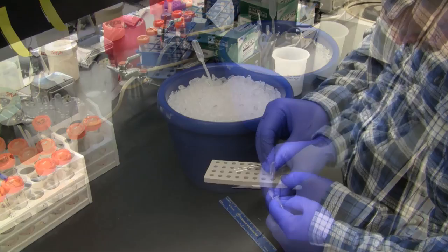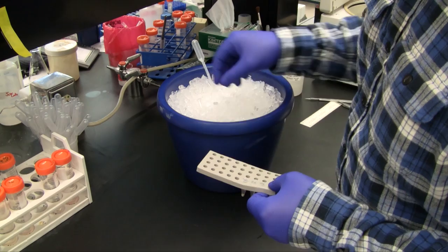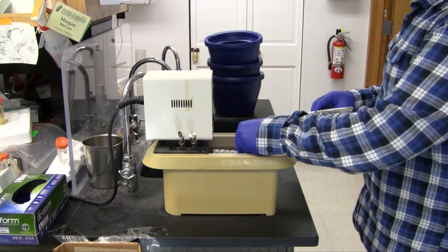After all samples have been collected, the tubes are placed in a 37 degrees Celsius water bath for 45 to 60 minutes. The amount of time required for digestion varies and needs to be determined empirically. Some factors to consider include genetic lineage, whether the root came from a seed or a plant, its size, and how long it was stored in ethanol.